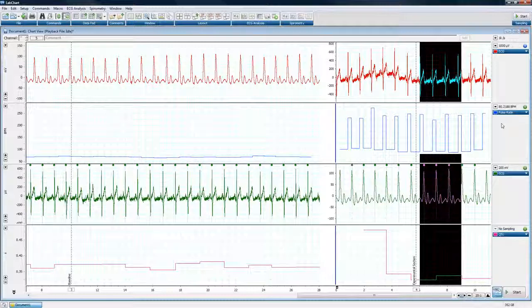But first I just want to speak about how this is helpful. Again, if you were recording multiple channels and say one day you only need to record from some of those channels, you can set up a settings file that makes it so. The rest of those can be left alone and not recorded from, and you can set it up so you don't have to worry about the hardware. You can simply do this in the software, and on any given day you can record from exactly what you want to record from.